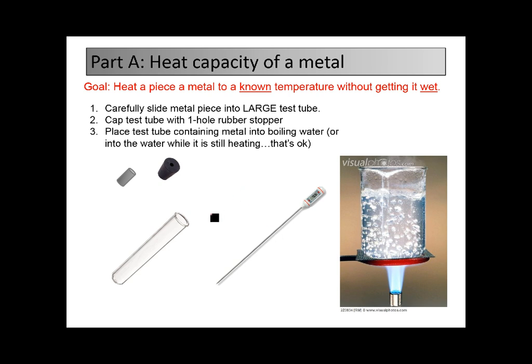What we're going to do is get your large test tube, and you're going to carefully slide the piece of metal into there. If you do it too hard, you can blast it through the end and break it. Put your stopper in — it has the one hole — and go ahead and insert your thermometer in here. Once you have this set up, you can go ahead and put this into the boiling water and heat it up close to the boiling water temperature. That should keep it dry, and you can then know exactly what the final temperature is of the metal — actually, it's going to be the initial temperature of your metal in the experiment. This is a way to get to a known temperature without getting it wet.